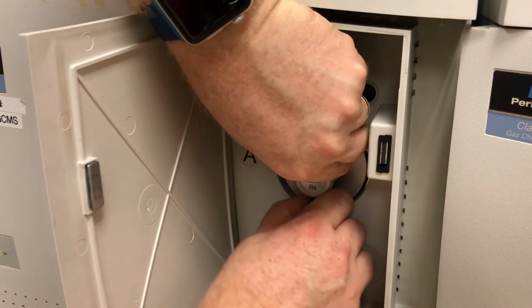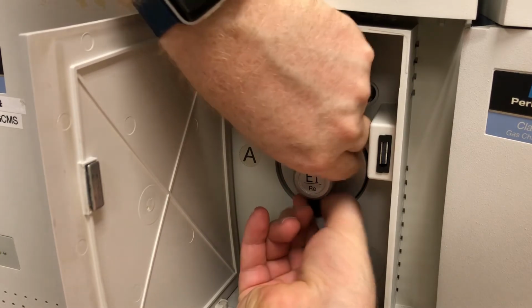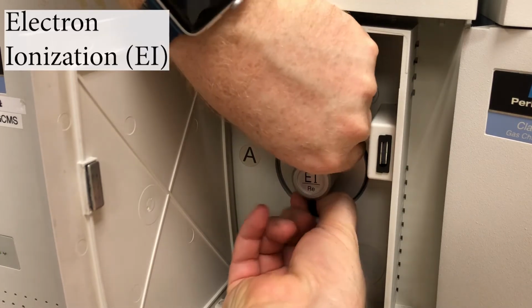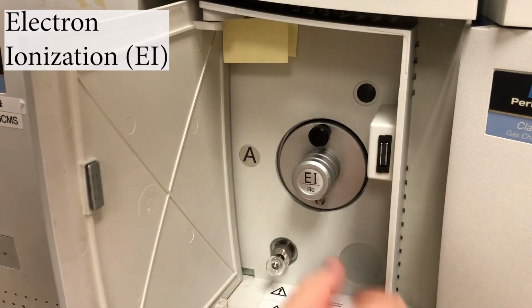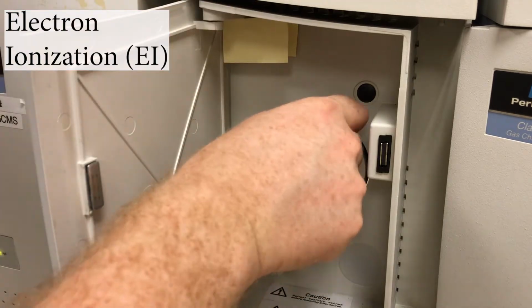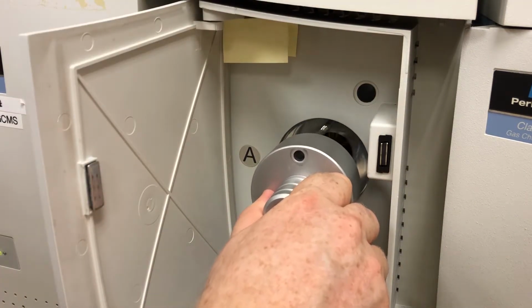So it's sealed up because EI and CI have to be done under vacuum. They have to be in vacuum. So again, EI is electron ionization. An old school term for it is electron impact, and you may hear some people refer to it. That's kind of an antiquated term. It's not an accurate description of what happens.